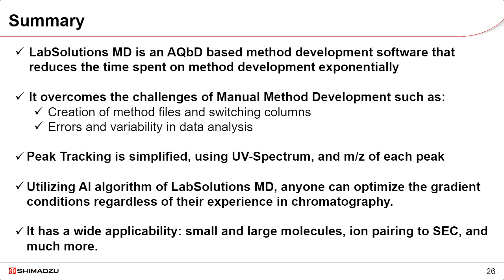And when we're evaluating data, the more regular our tools can be and the more they can apply to a large data set, again, we reduce errors and variability in that analysis process as well.